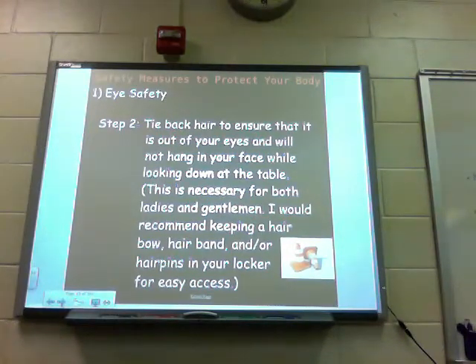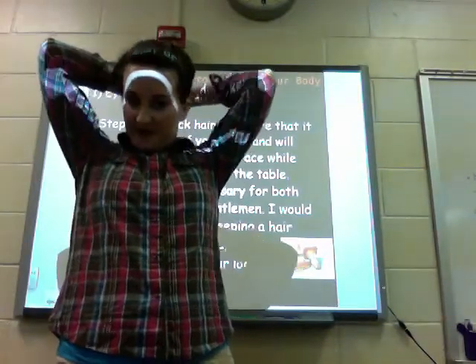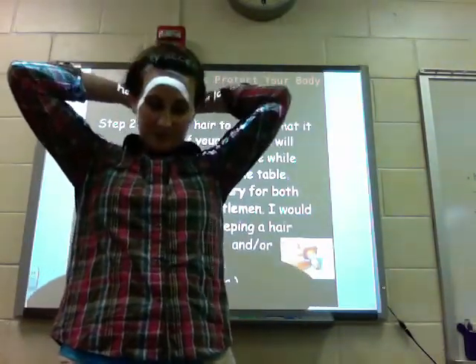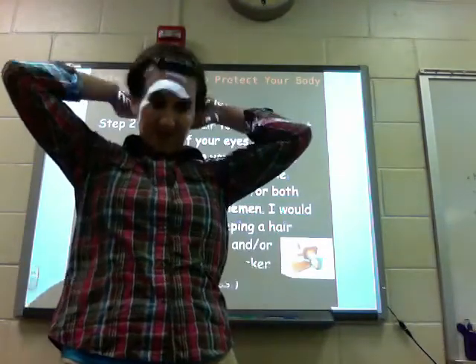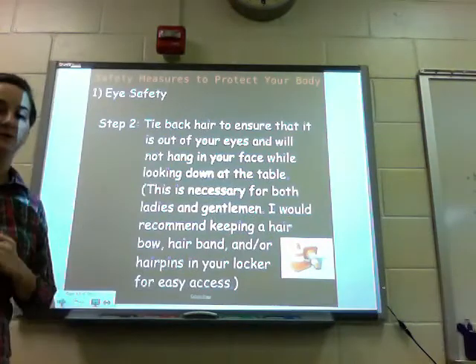Now we need to deal with hair. Before we begin a lab, we need to tie back the hair to ensure that it's out of your eyes and will not hang down on your face while you're looking down at the table. This is necessary for ladies and gentlemen. I would recommend that you keep a hair bow, a hair band, or hair pins in your locker for easy access for labs. Me and Ms. Gold pull our hair back for labs too. Remember, you don't have to keep it like this throughout the rest of the day — all you need it for is science class.